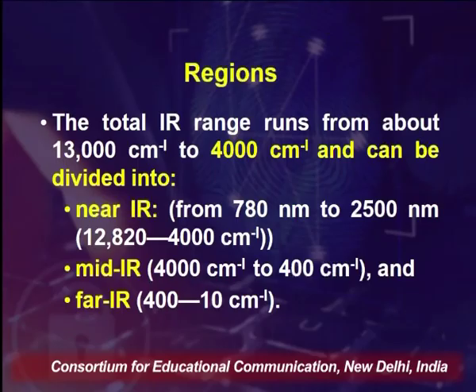The mid IR region is the place where most of the specimens in forensic science have their peaks. Whereas the far IR region is basically used to determine structures which have the same formula but different structures; we call them isomers. So, depending upon our specimen, about which we have certain knowledge from various preliminary techniques, we can analyze the specimen under the windows of the near IR region, mid IR region or far IR region.